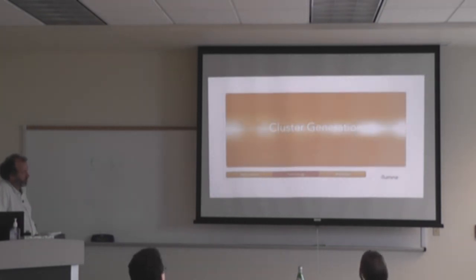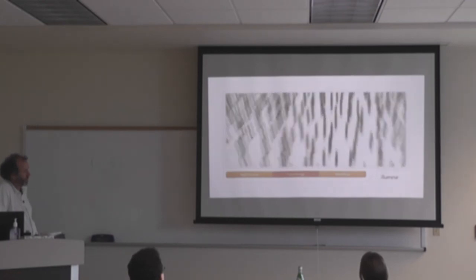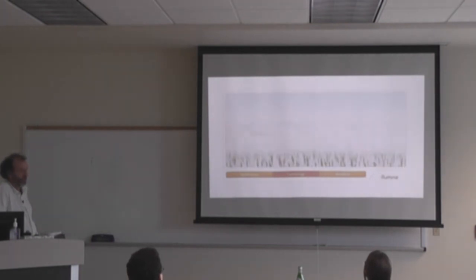Cluster generation. On the CBOT cluster system, single molecules are isothermally amplified in a flow cell to prepare them for high throughput sequencing. The 8-channel genome analyzer flow cell has a dense lawn of oligos grafted to its surface. These oligos bind to the adapters ligated to the library fragments. Single DNA molecules hybridize to the lawn of oligos. Bound fragments are extended to create copies. These copies are covalently bound to the flow cell surface.